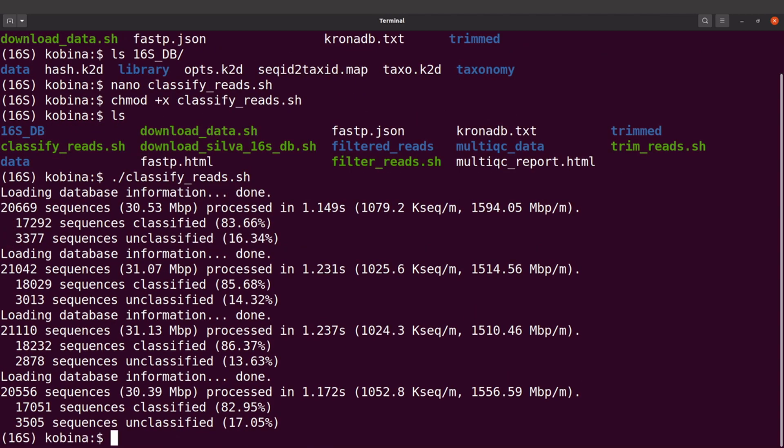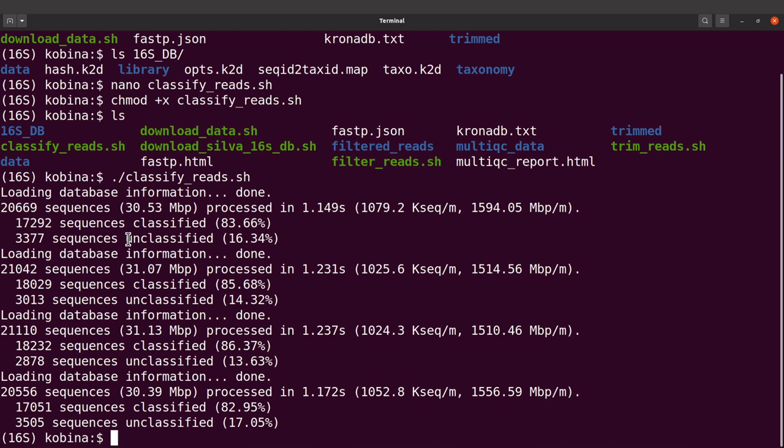Okay, so everything has been done. We have the summary for each file. This one has 83.66 percent of the sequences classified, and unclassified is 16.34 percent. You can also check for the other ones. We see that the majority of the sequences have been classified, so that is okay.